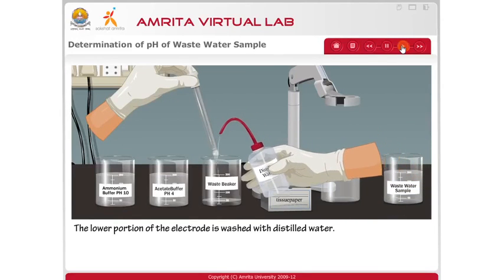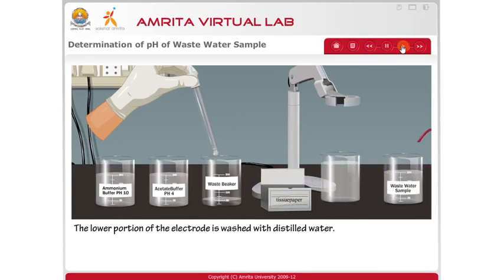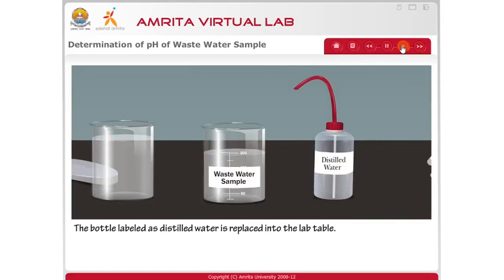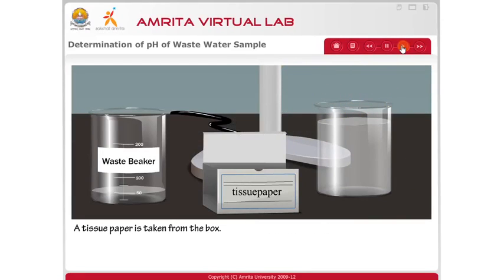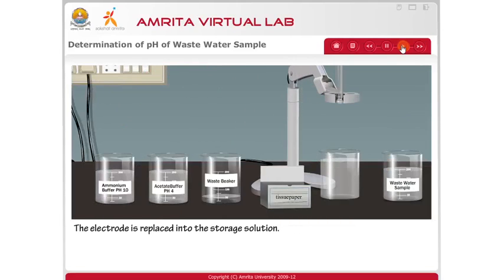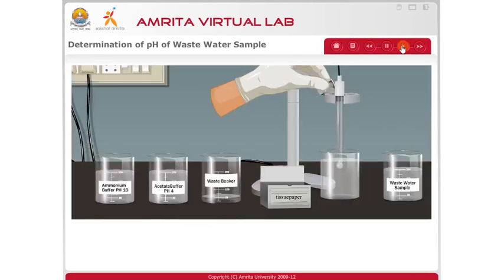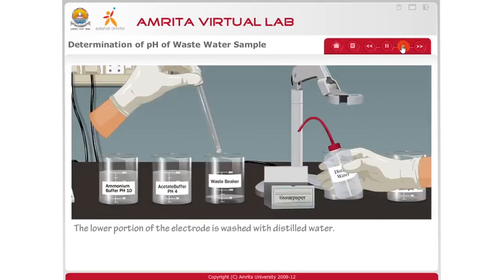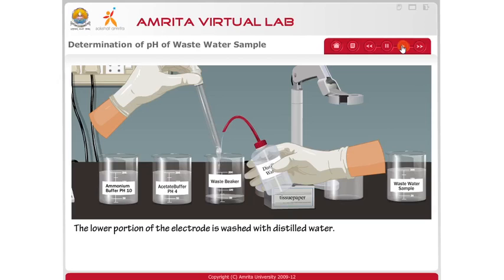Each time you have to be careful about rinsing. When you switch from one solution to another, you have to rinse it with distilled water, otherwise your measurements will not be accurate. And then into the storage solution, and now again rinse it.